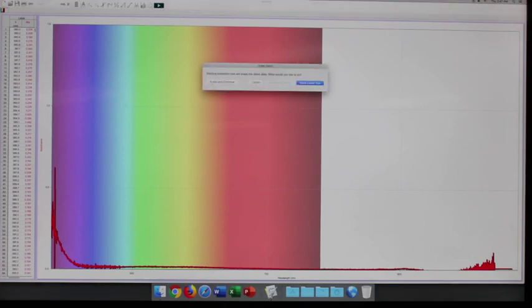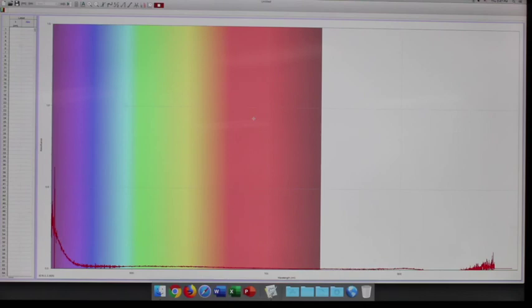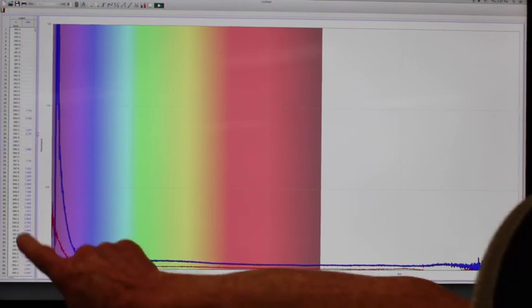Hit play up here, and we will store the latest run so we can compare both. Then I'm going to hit stop and finally go down to 390 nanometers, and the value is 0.976 O.D. And that's the value to record in your lab.